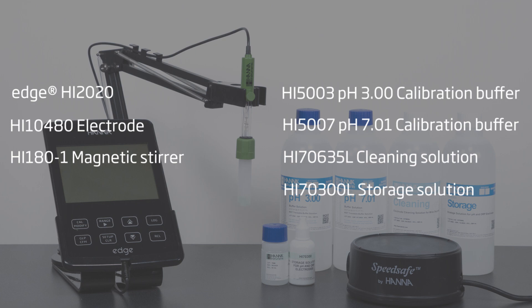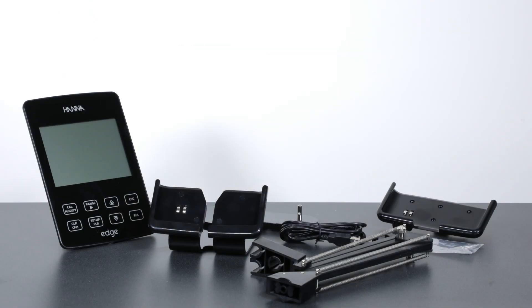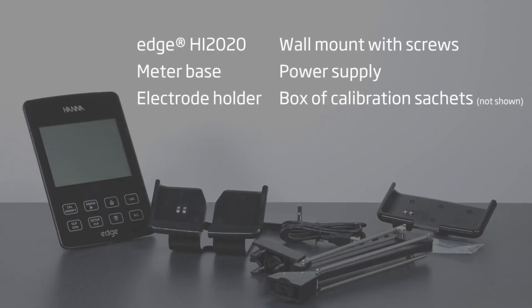The Edge meter itself comes unassembled, packaged with all the accessories in a nicely covered box. Inside is the Edge HI-2020 pH meter, the meter base, the electrode holder, and a wall mount with screws.